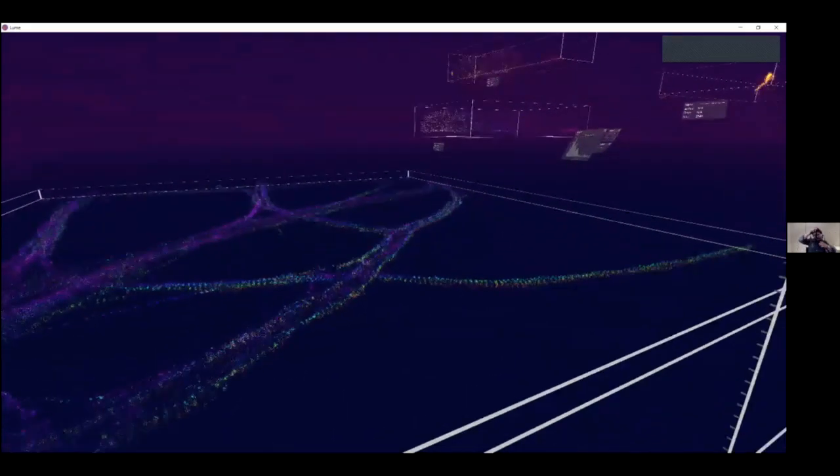You have here a live demo of a T cell, T helper cell, and can you share that with us and just tell us a little bit about the process and what you're doing? Yeah, I'm just... Please let me know when you see my screen. We see it. We can.